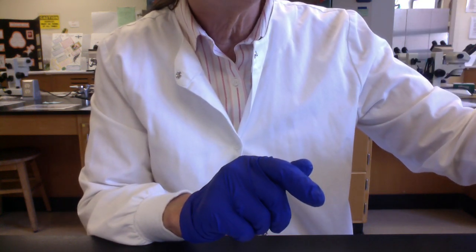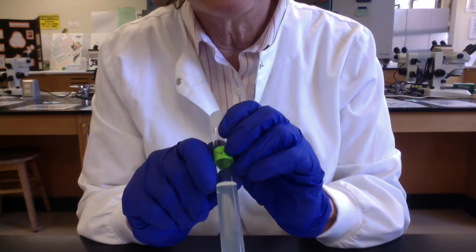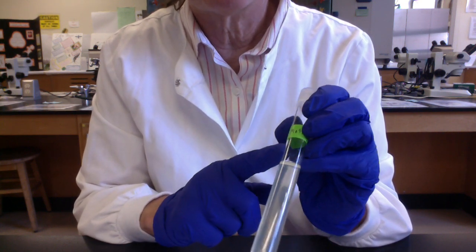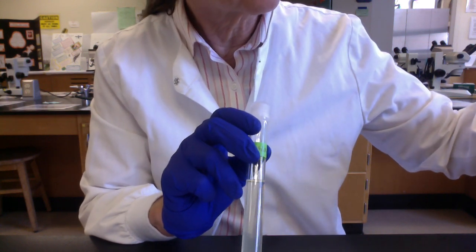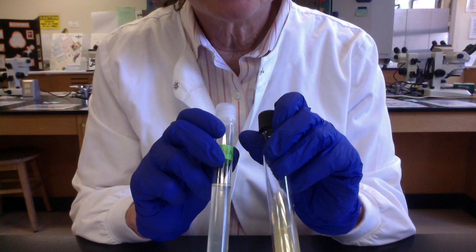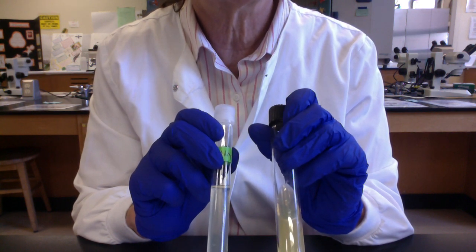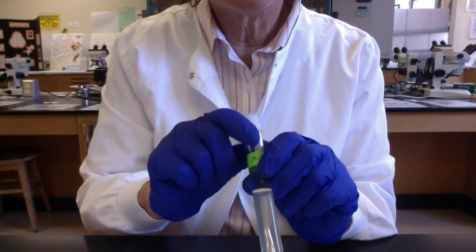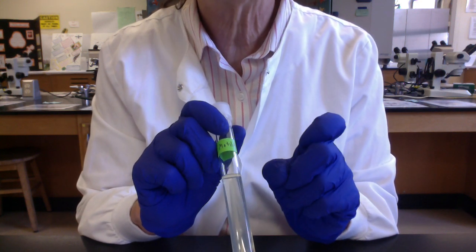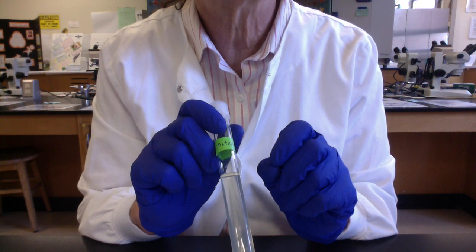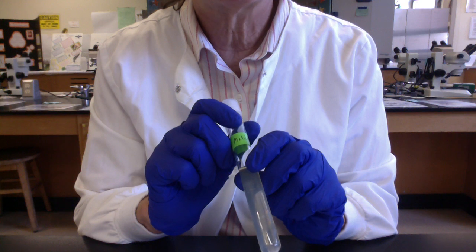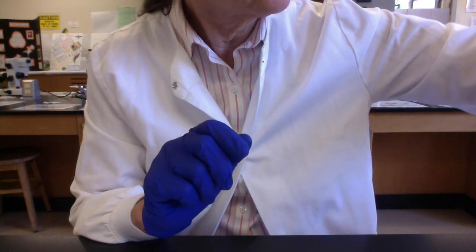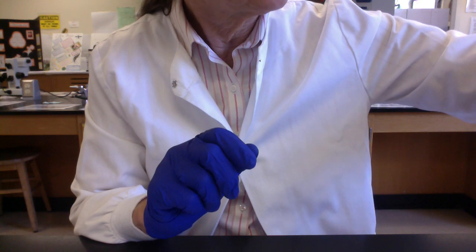This will be chapter 9. Another example of agar is we can use them to test motility. So this is an example of motility agar, which we'll inoculate for chapter 9. Normally, our agar media has an agar concentration of 1.5%, which means 1.5 grams of agar for every 100 mils. With motility agar, because we want our microbes to be able to literally swim into the agar, we're going to decrease the agar concentration to around maybe 0.4%, 0.5%, which means 0.4 to 0.5 grams of agar per 100 mils. And just as we mentioned, we can add different ingredients to our broths. We can add different ingredients to our agar slants.